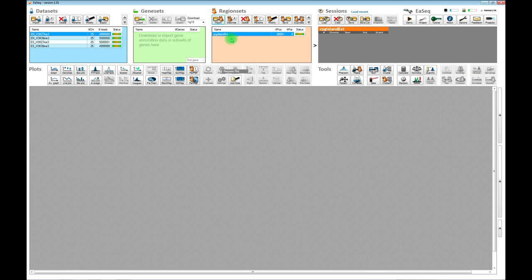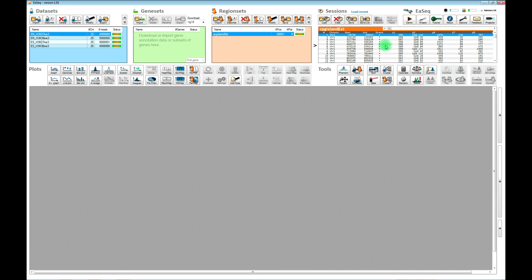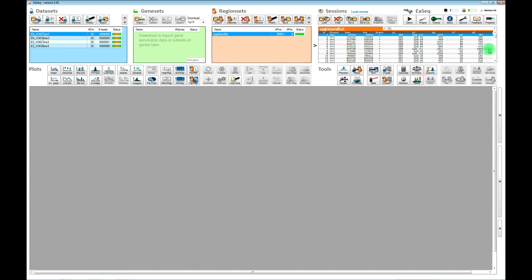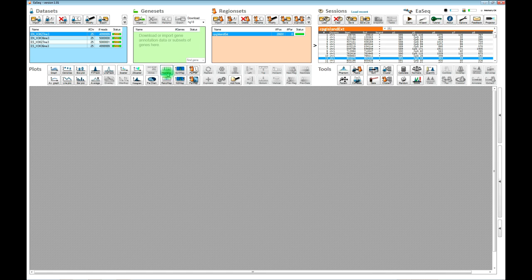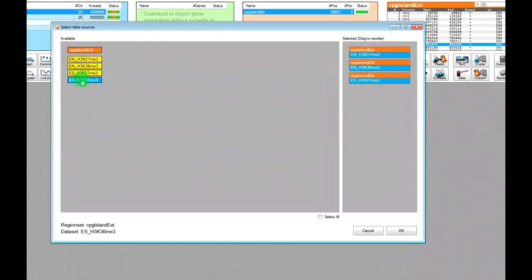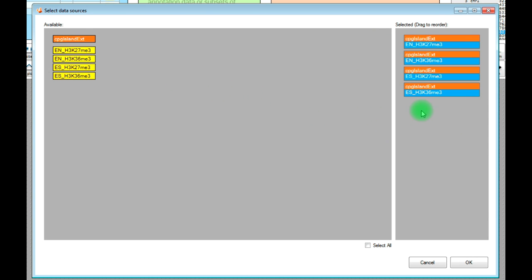Now we have a region set and four different datasets — these are downsampled so they don't take up much space and are fast to download. If you click on the region set, you can see some information about the CpG islands and browse the coordinates one by one. Now that we have a region set and some datasets, we can start to make the first plot. I suggest we make a heatmap of the four different datasets. You can change the order of the heatmaps by simply dragging and dropping.